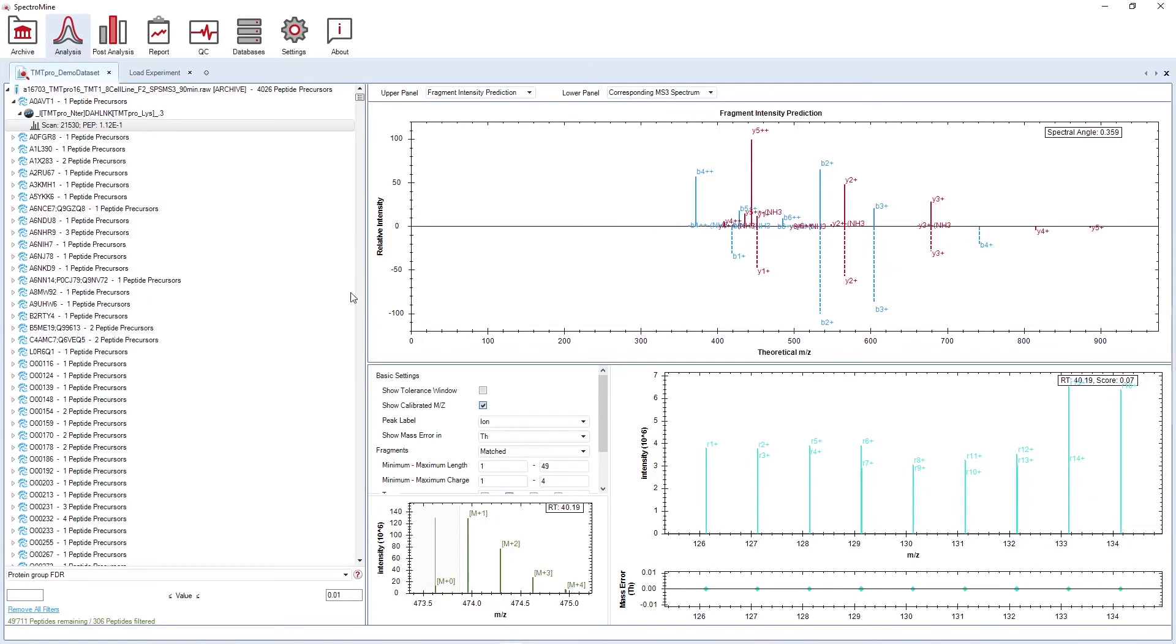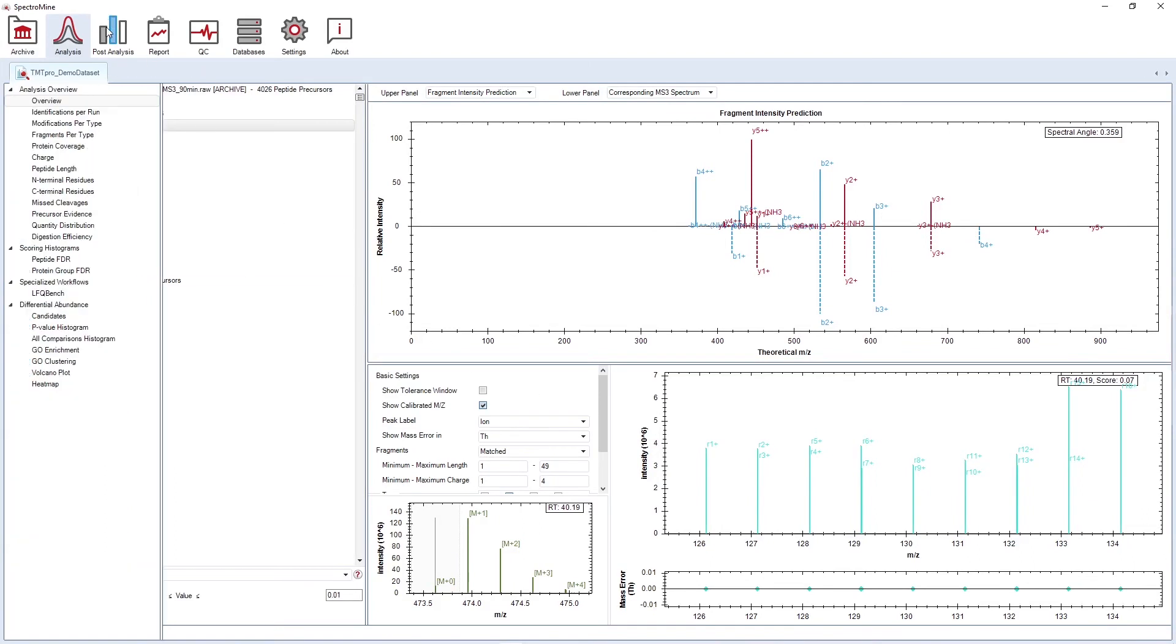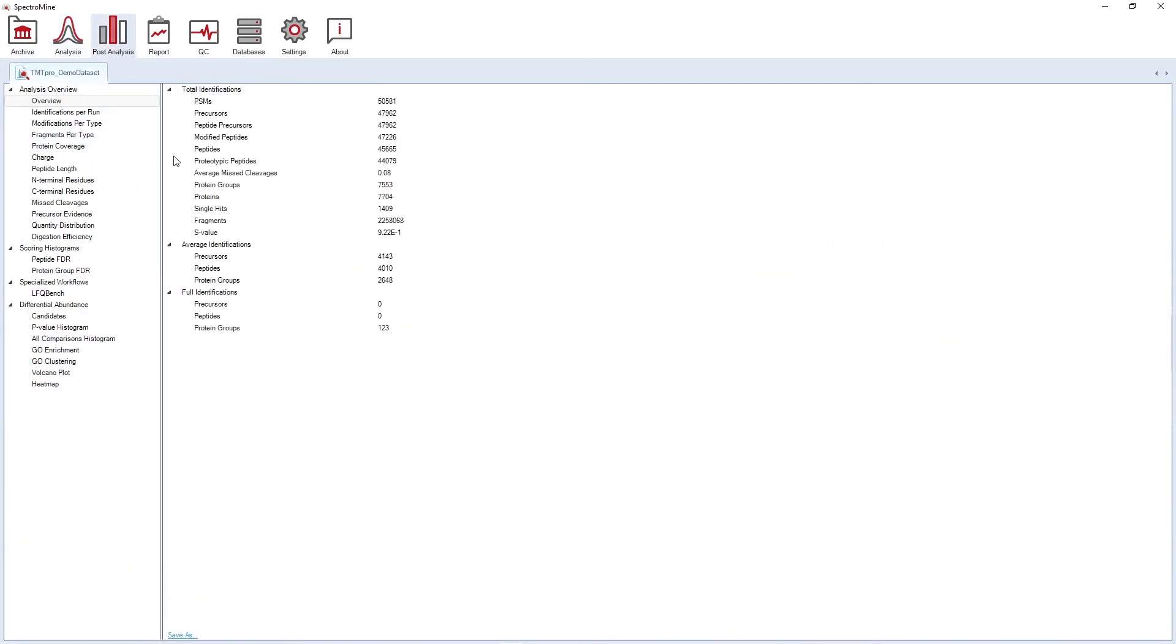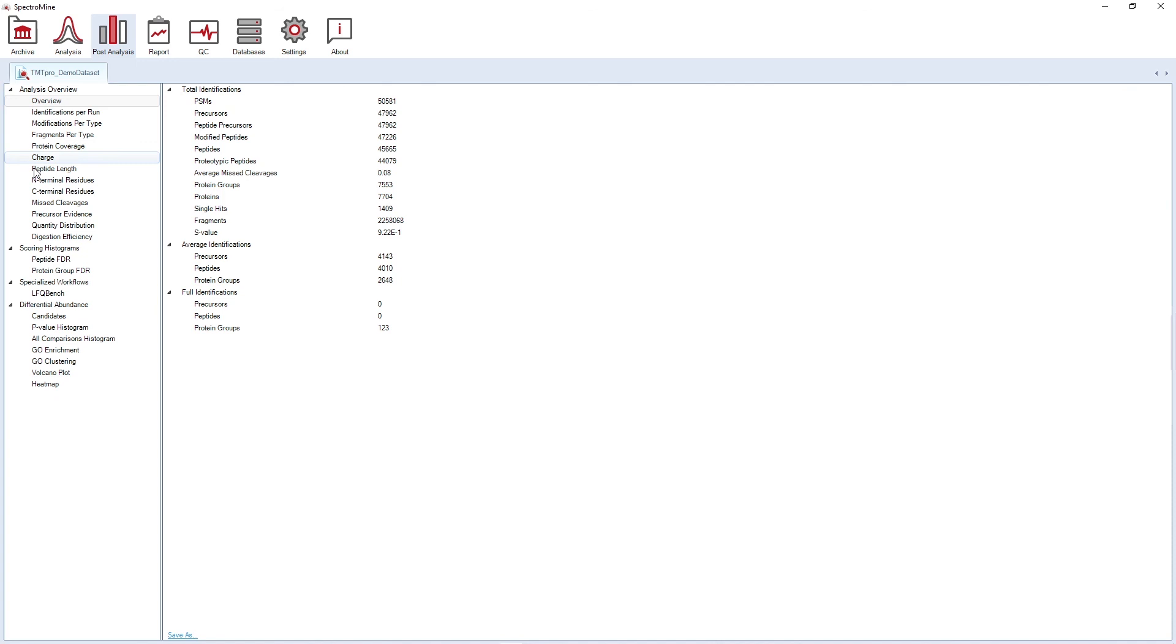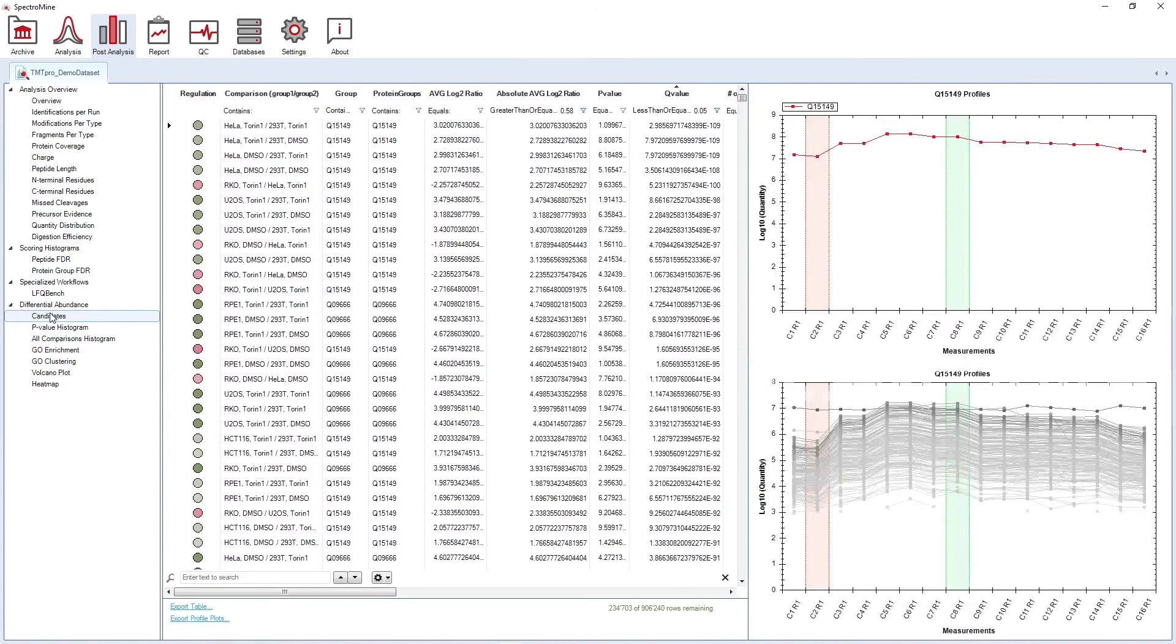In the post-analysis perspective, you get an overview of your experiment and also several plots. Under the differential abundance node, you can find the results of the differential abundance testing.